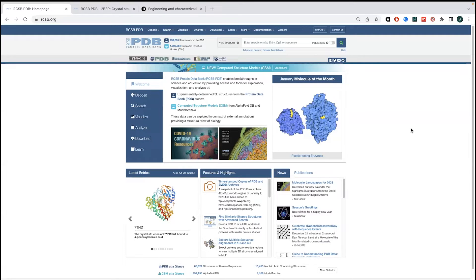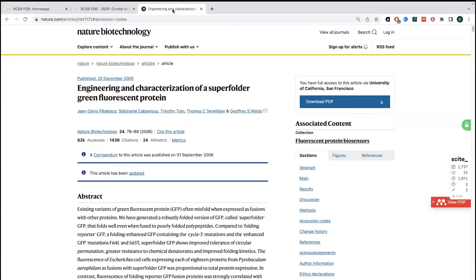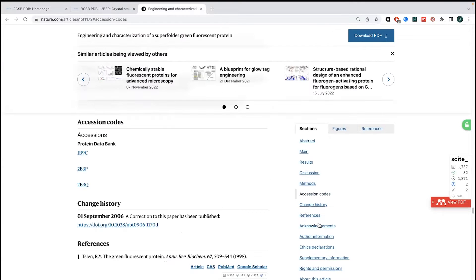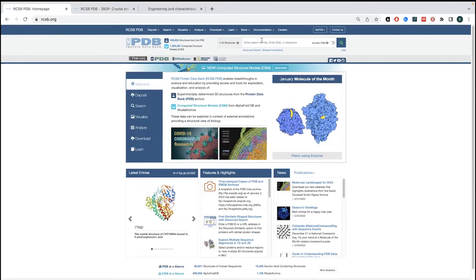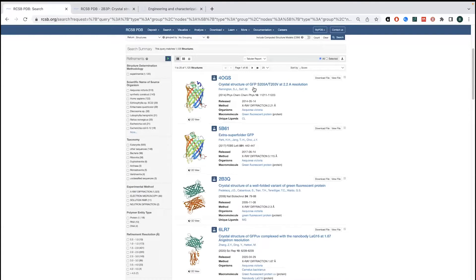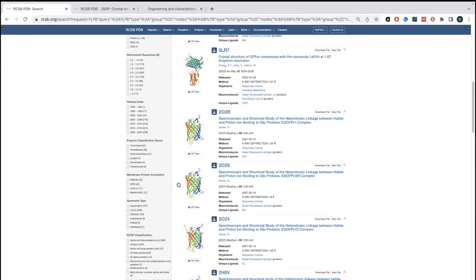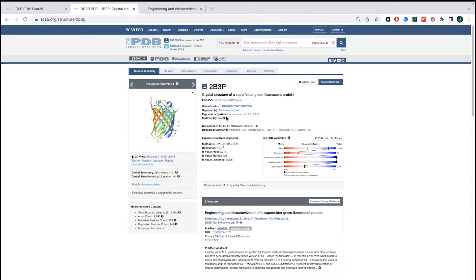You might come across the PDB code in several ways. One is in a paper — at the end, if they use structures, they'll have the accession codes and you can click directly to get to them. It will take you to the entry for that structure. In this case, this is 2B3P, which is a GFP fluorescent protein that I've been using as an example. You could also find it directly in the PDB by searching 2B3P, or by searching for GFP, which is how I found it. You can then see a bunch of different structures and check them out. You can download directly, and there's overall global data shown here.